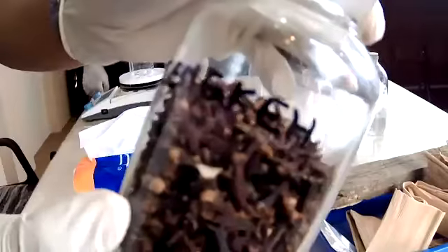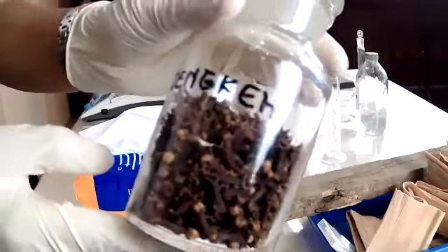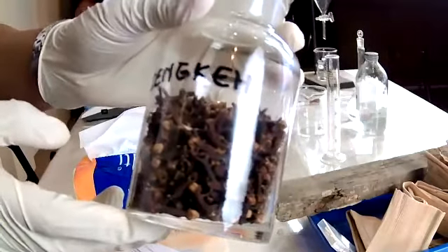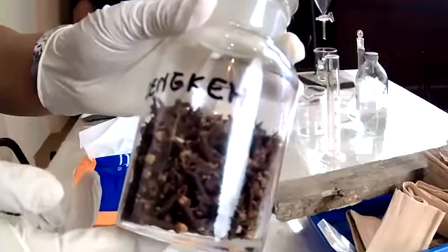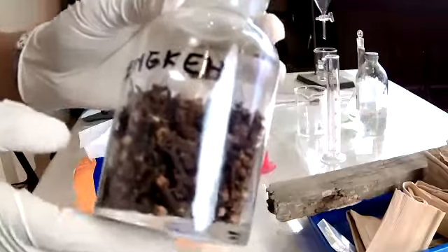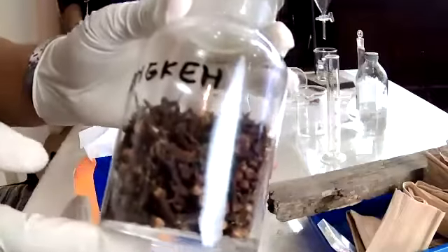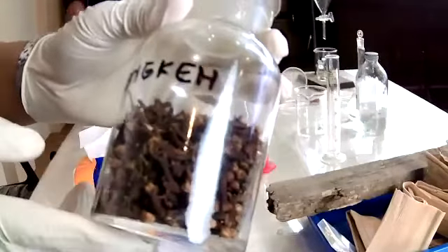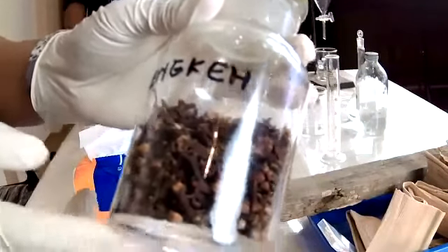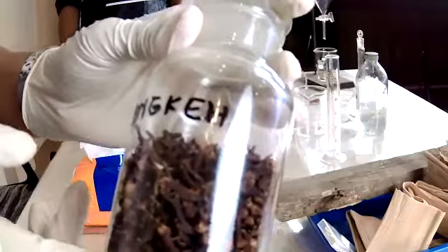The second source that we're going to use is clove. These are the clove blossoms. As you know, the plant itself has leaves and also flowers, and these are the blossoms, and also the skin, or the bark, of the plant. This type of natural product is actually multi-use, so there are many other uses for other purposes.